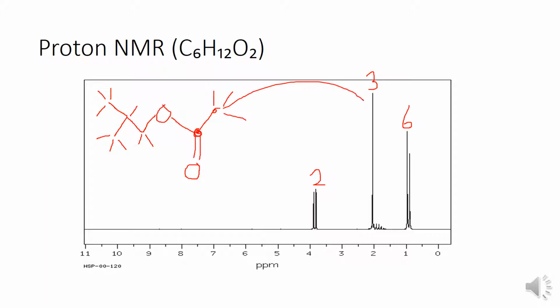All right. Moving on to the next. We have a septet right here. We have our singlet right here. And then these 2 are slightly different. We'll see why in just a moment. So we have our integration number of 2 here. So we know that it is more than likely going to be an indicator of this carbon here with 2 hydrogens in this environment. So as we talked about earlier, this looked like it was split, so our hydrogens may have been split as well.